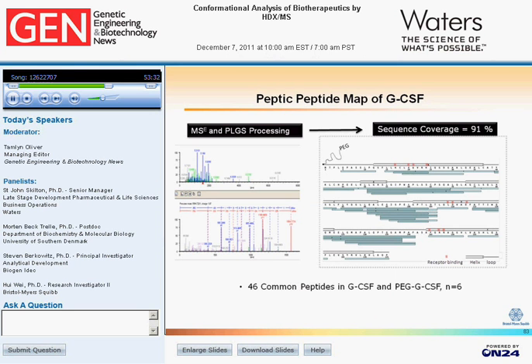The high sequence coverage allowed us to monitor and compare deuterium incorporation in local regions between the 2 proteins, revealing conformational differences and the subsequent impact on the protein's biological activity if the changes are observed in or near the receptor binding sites. Next slide.